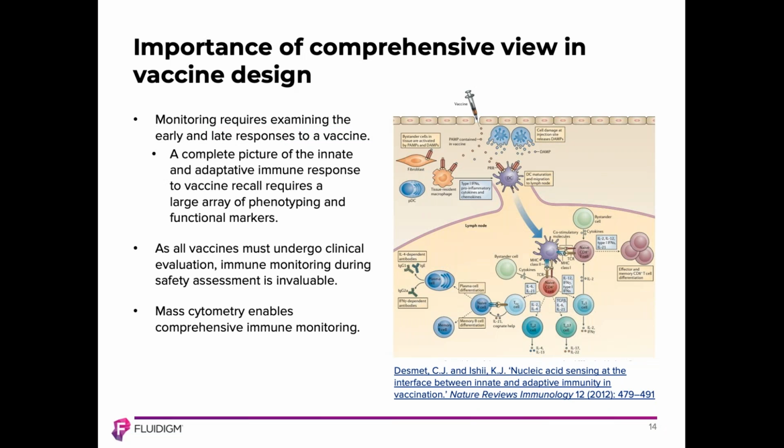While the humoral response remains the gold standard for many pathogens, and understanding the humoral response to these pathogens is still incredibly useful, mass cytometry can monitor both the innate immune system's response to early antigen delivery events and downstream T cell mediated immune responses to the vaccine.